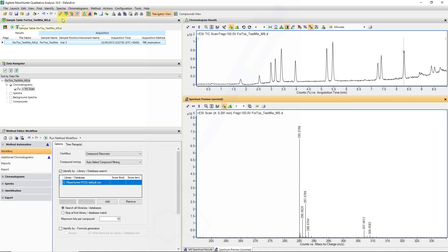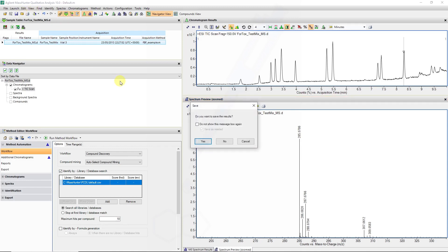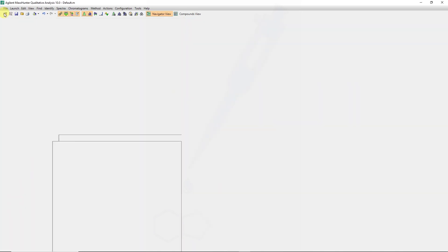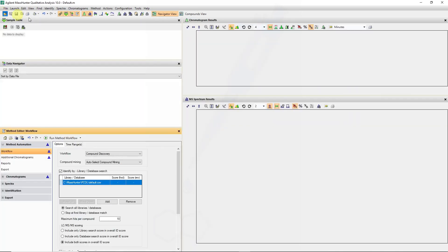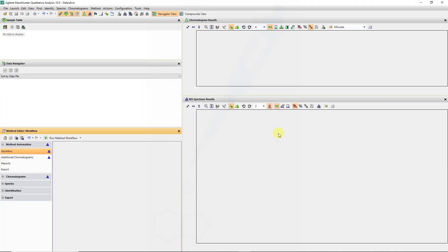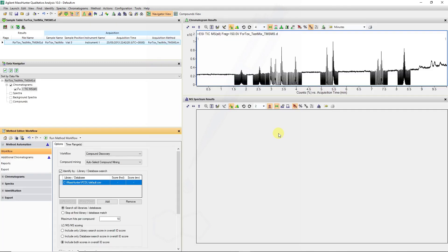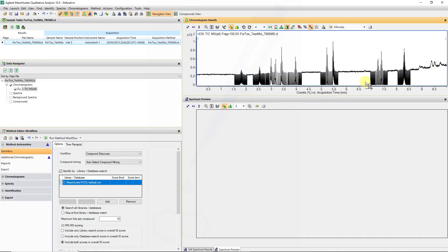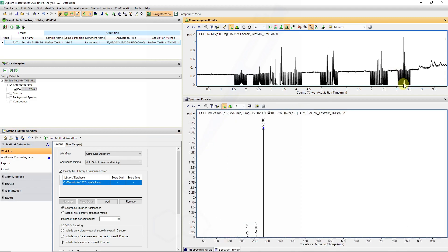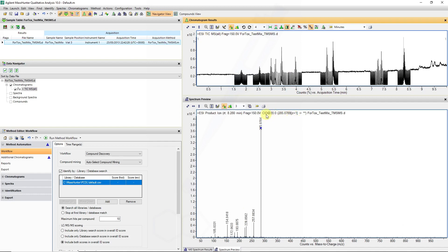For us to import data into Molecular Structure Correlator, we need some targeted MS-MS data. For that, I will open an MS-MS data file. And here you can see, if you put your chromatogram tool at that peak at 8.5, you can see there are instances where that 285 ion was selected for fragmentation, and we have different fragmentation energies.